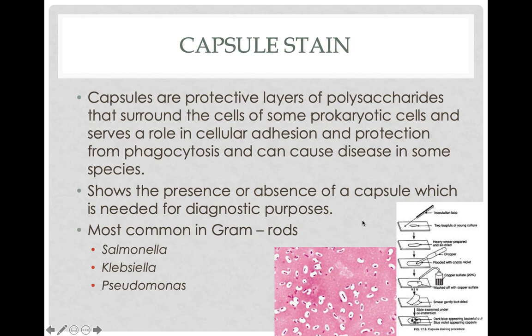So you wouldn't know that that was there. You can't see them underneath a microscope. They're clear. So what you have to do is stain the background. This capsule doesn't absorb stain, it doesn't soak up colors. It's really dense. So the bacteria takes up some color, this thing doesn't. You see the background that's stained, the bacteria that sucked up some color, and then a big empty colorless blob where the capsule is located.